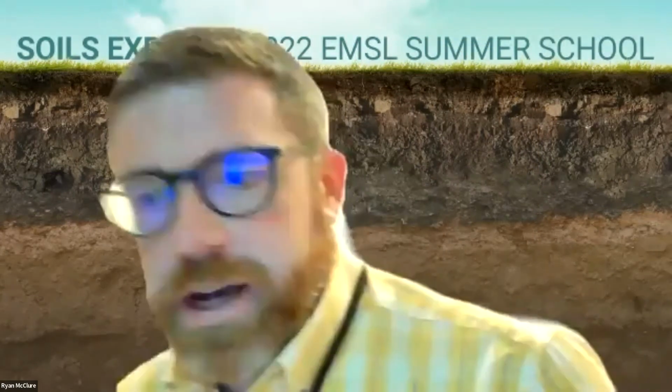Great. And then maybe while folks are taking all of that in and thinking about what questions they want to ask, I can just get things rolling. So you and I, Ruonan, have worked together a lot on this. When you get all of this data in for either metagenomics or viral metagenomics, the networks that you're showing, the heat maps, these maps of the genomes, are very complex, and sometimes very hard to interpret and visualize by just a person looking at them, whether on a slide or in a publication.